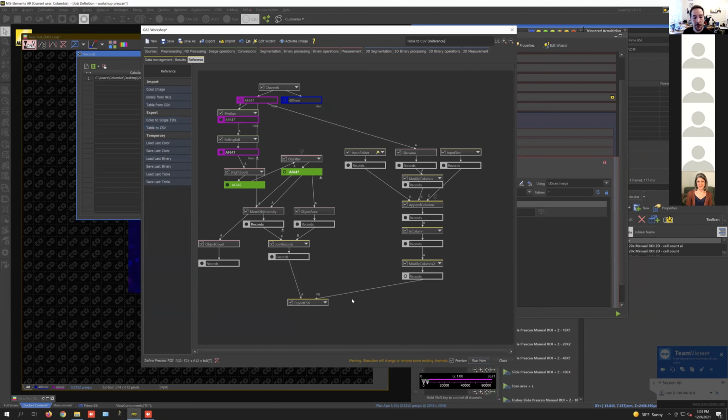To save it as a file that we can interpret, we have to add in all of these modules here. And all this is doing is getting the input folder, or the folder that we're capturing the data into. So this would almost be called the output folder, really. The file name, so this is coming from the image that's being captured by the microscope, and some input text. And we're just putting a .csv at the end so that it knows to call it a CSV file.